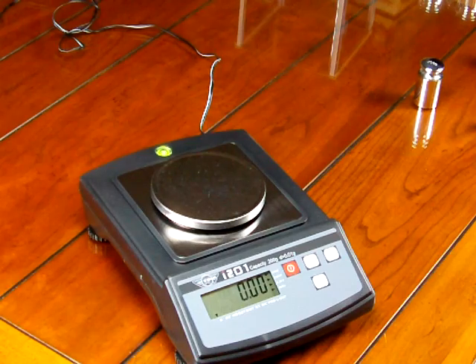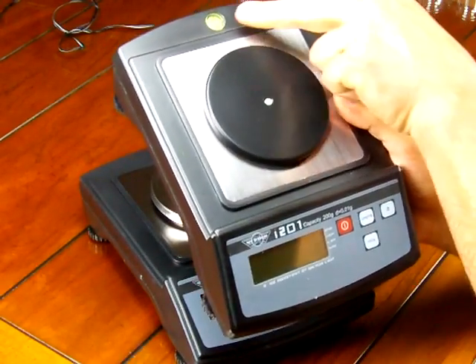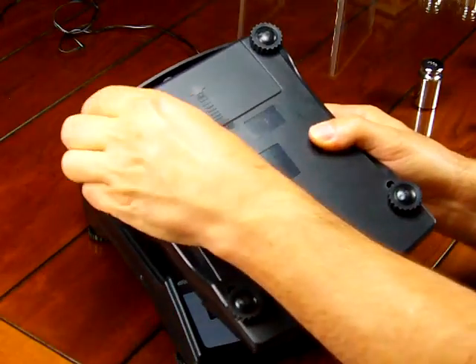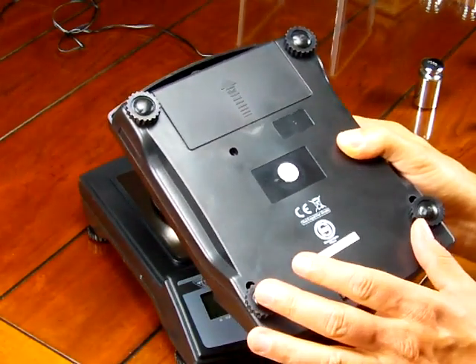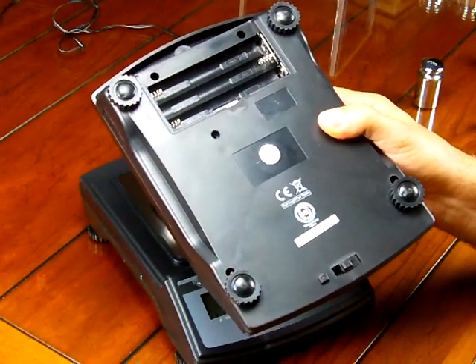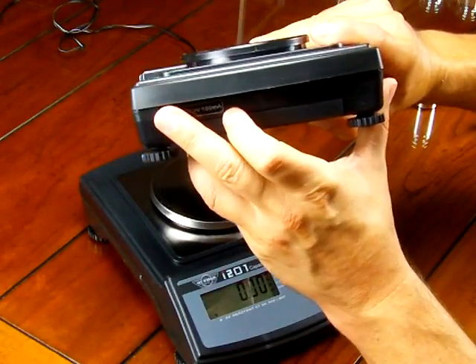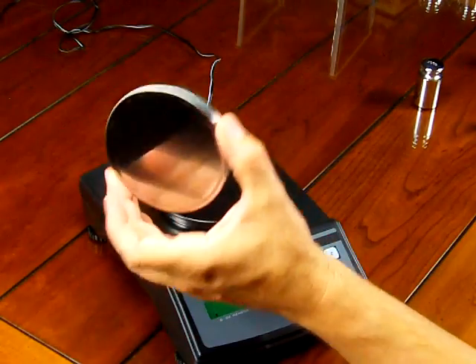The scale comes with an AC adapter, which is a nice feature. It also has a spirit bubble indicator for easy leveling, and on the rear of the scale you have four adjustable feet — most scales in this pricing category don't have adjustable feet, or only have them on the front. The scale can also be operated off six AA batteries inserted in the rear, and it features a stainless steel platform that's removable for easy cleaning.